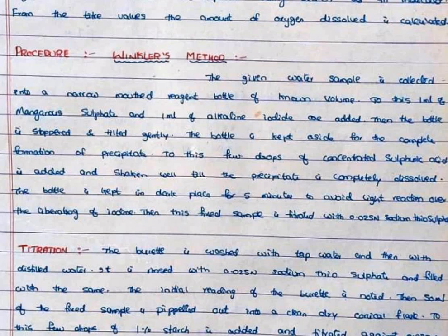To this, few drops of concentrated sulfuric acid is added and shaken well till the precipitate is completely dissolved.